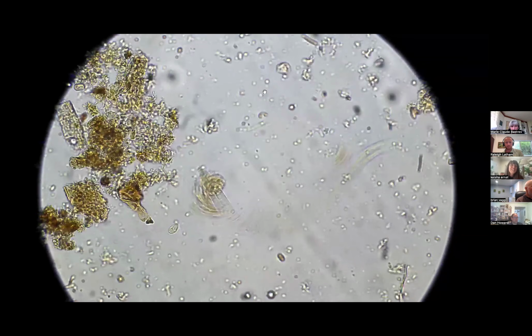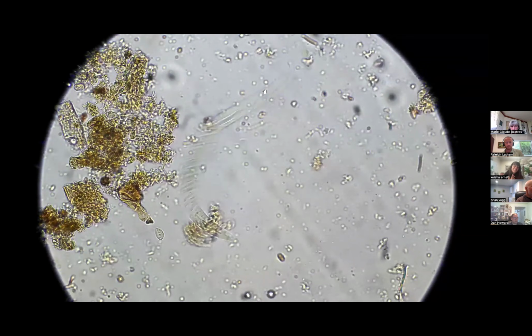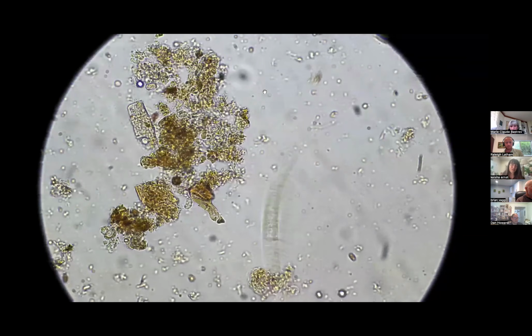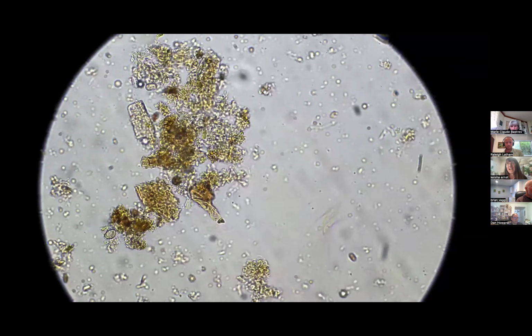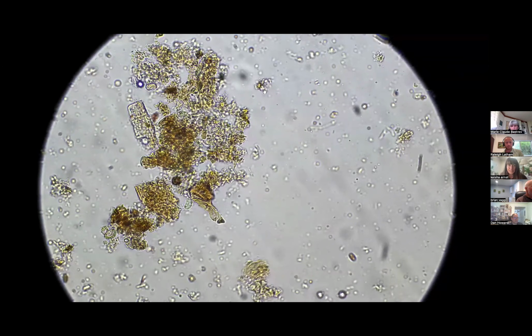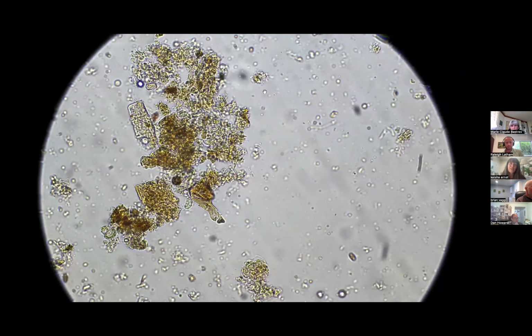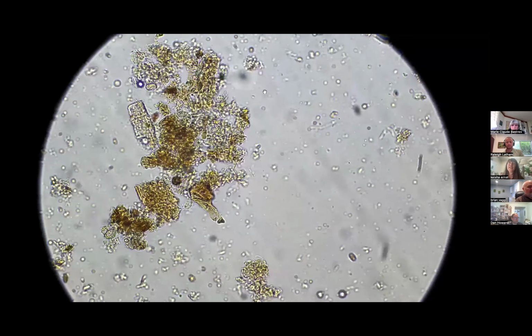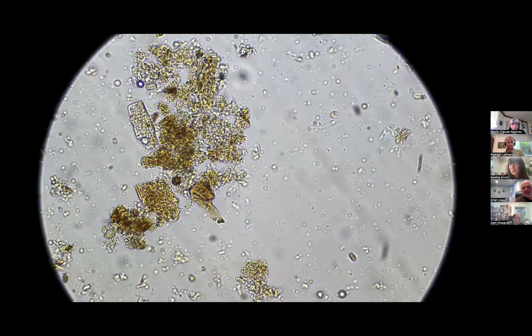I like to look at nematode populations as an indicator for healthy soil because I don't think they tolerate disturbance or chemical loads very well. When you see a really nice, diverse population of free living nematodes, including potentially parasitic ones, that's a really good thing.